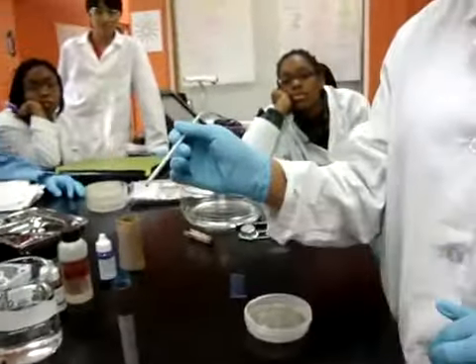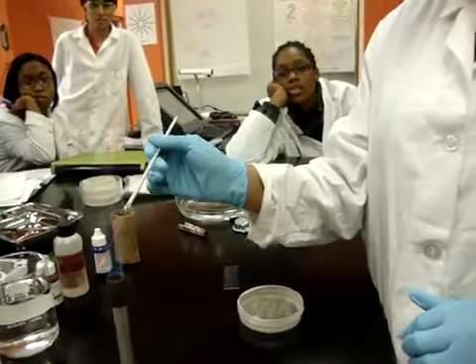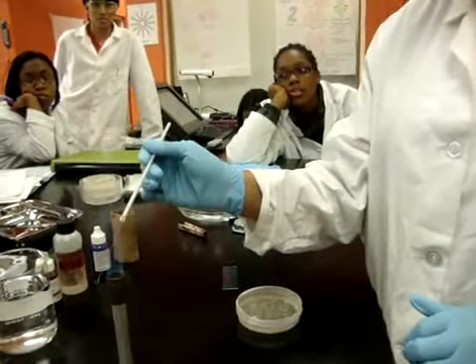I'm going to sterilize my loop again. Yes, just one loop full of water. That's all you need.